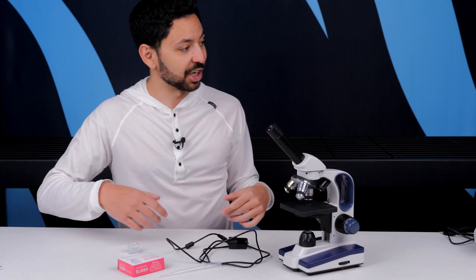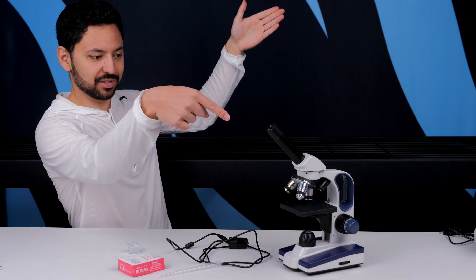If you'd like to see a walkthrough on how to set up a microscope and look at sperm, you can check out that video here — not just for this application, but also generally for any other kind of microscope, at least the common consumer ones you're going to find out there.